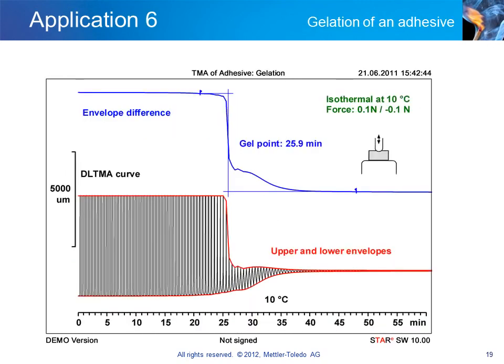An adhesive is initially in the liquid state. During isothermal curing, the viscosity of the thermosetting resin increases with increasing conversion, and the resin undergoes cross-linking to form a solid. From the technical point of view, the gel point during the curing process is of major interest because it is the point at which the adhesive becomes attached to the structure involved.